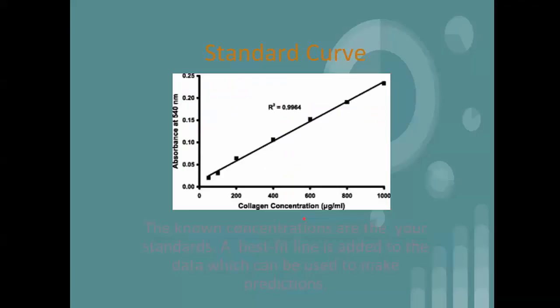So that's what we'll be measuring, and so our x-axis is going to be sucrose, or perhaps we'll use salt this week, depending on how we set up the lab, but we'll have sucrose solutions on one axis, and we will have change in mass along the y-axis.